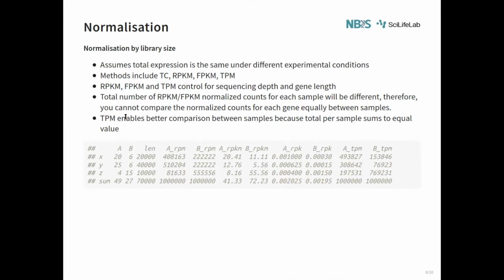But generally speaking, if you are interested in gene length, then preferably use TPM rather than RPKM or FPKM. So in this slide, the only useful normalization is TPM. You can ignore everything else. Maybe another point is RPM, reads per million. This is the same as counts per million, so CPM. And CPM is usually log transformed as well, so it's log CPM in practice.